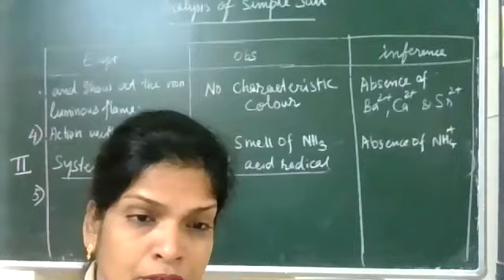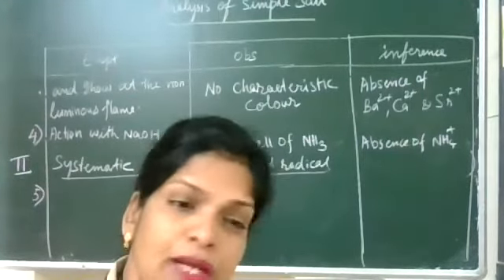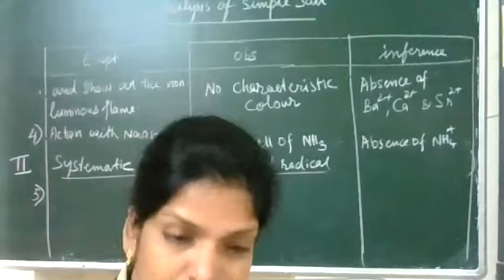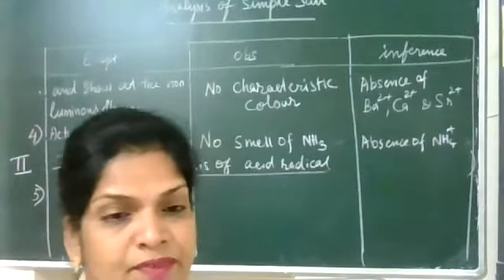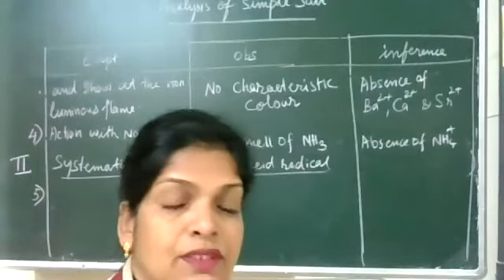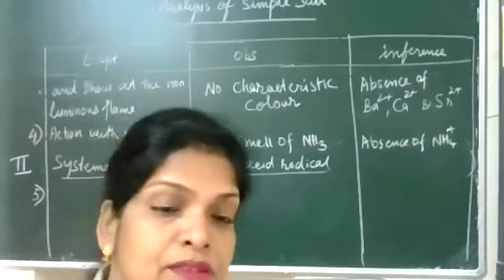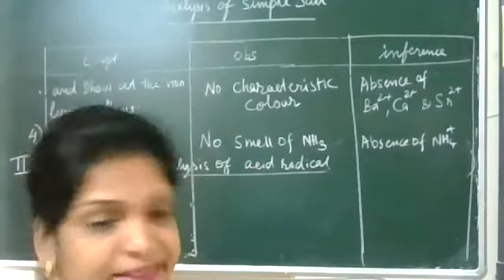So if you are getting an observation with dilute H2SO4, then you don't have to go to concentrated H2SO4. Do its confirmatory test and finish it off. If you are not getting with the dilute H2SO4, then you have to go to concentrated H2SO4, and if you get one from there, do its confirmatory test. So first we are doing with dilute H2SO4.